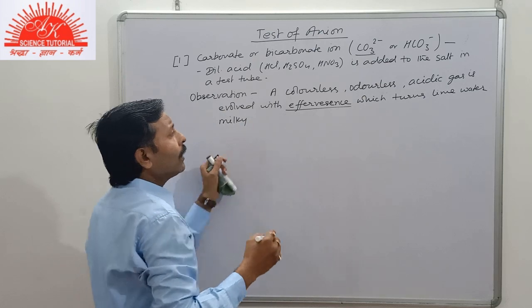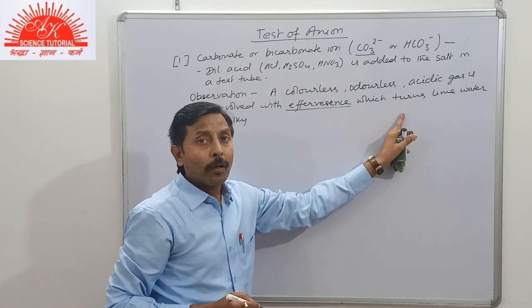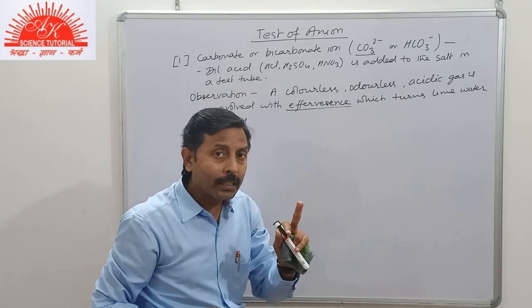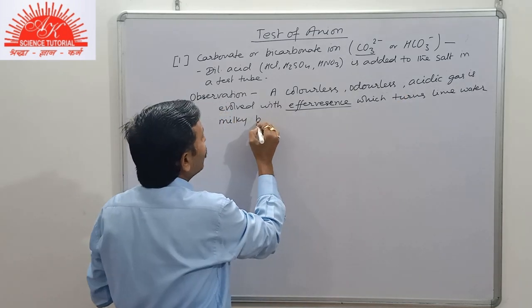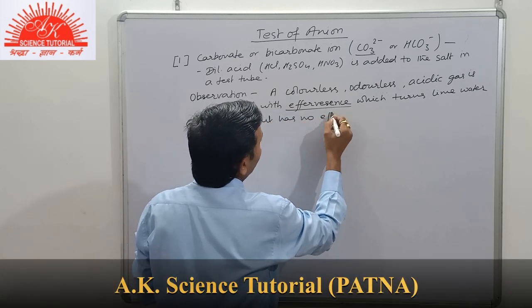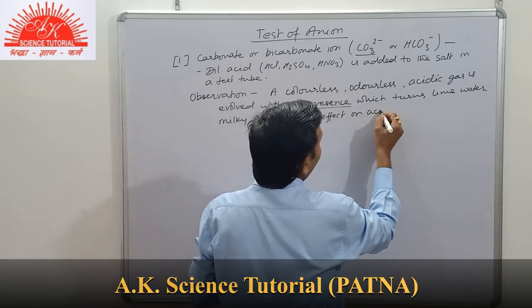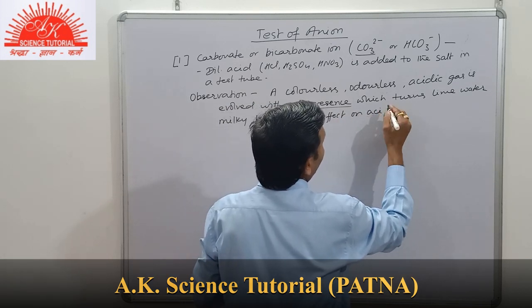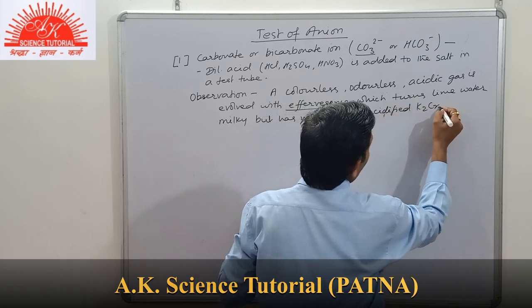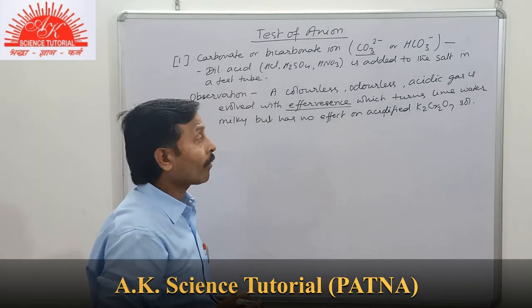Now a student, although this is used for the test of carbon dioxide gas, but it is also shared by sulfur dioxide. So what should we write here again? But has no effect on acidified potassium dichromate solution, which is orange in color.